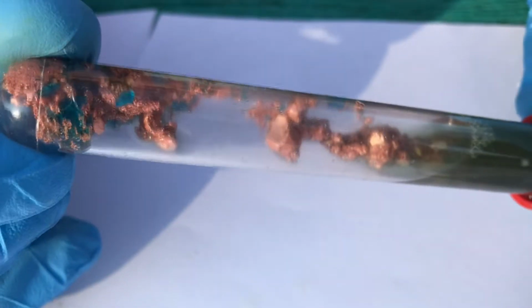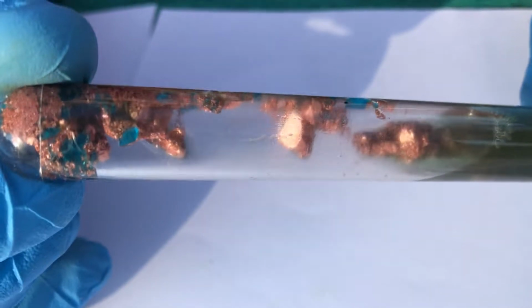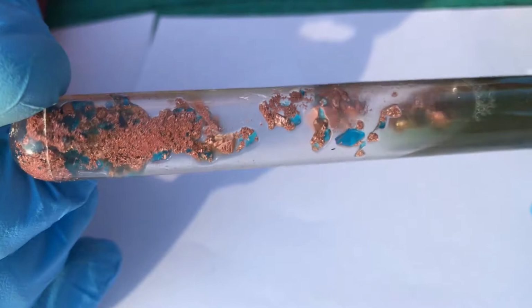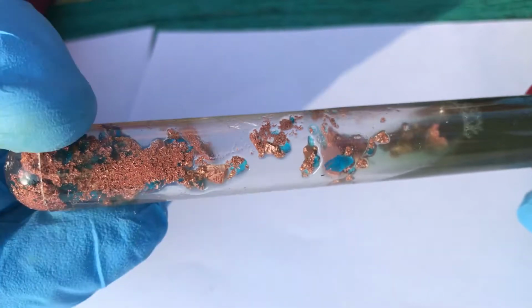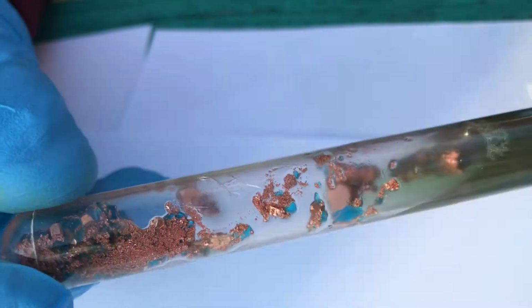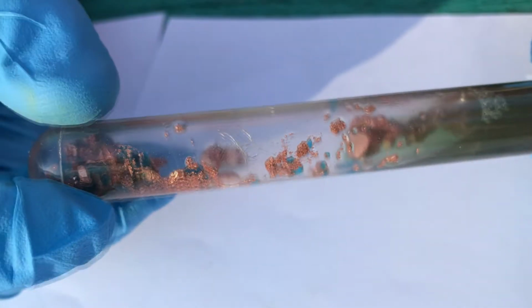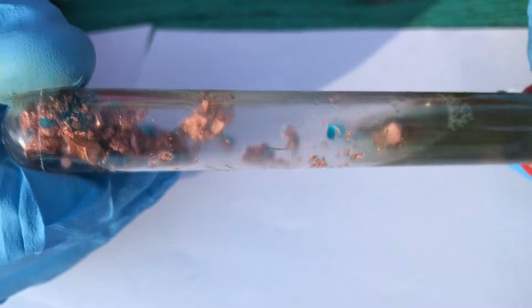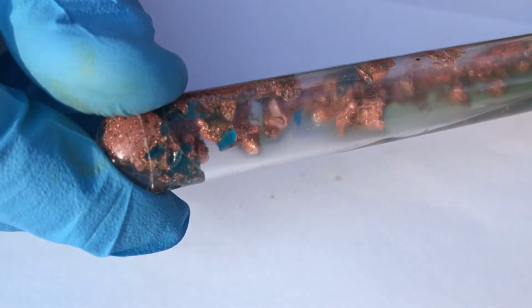Interestingly enough, the copper reacted with the sulfuric acid and the oxygen gas that was in the tube and formed copper sulfate. The formed solution was supersaturated, so it precipitated out some copper sulfate crystals. In the test tube, you can see the pure copper powder as well as some large crystals of the metal.